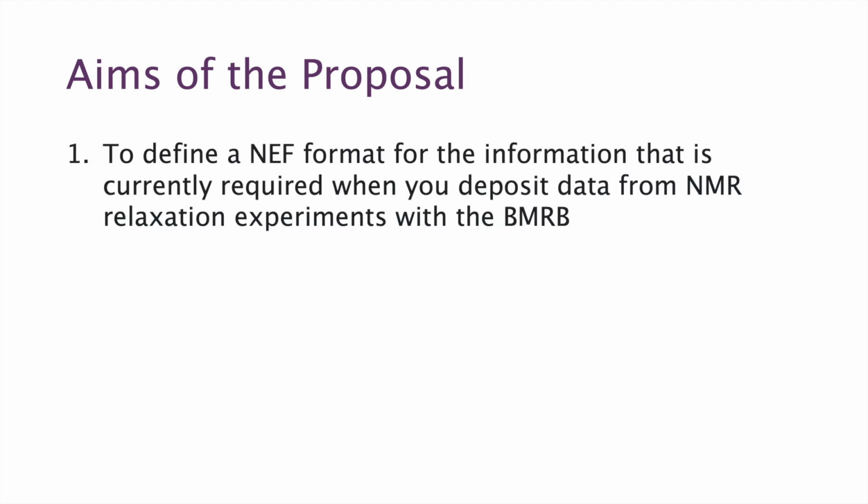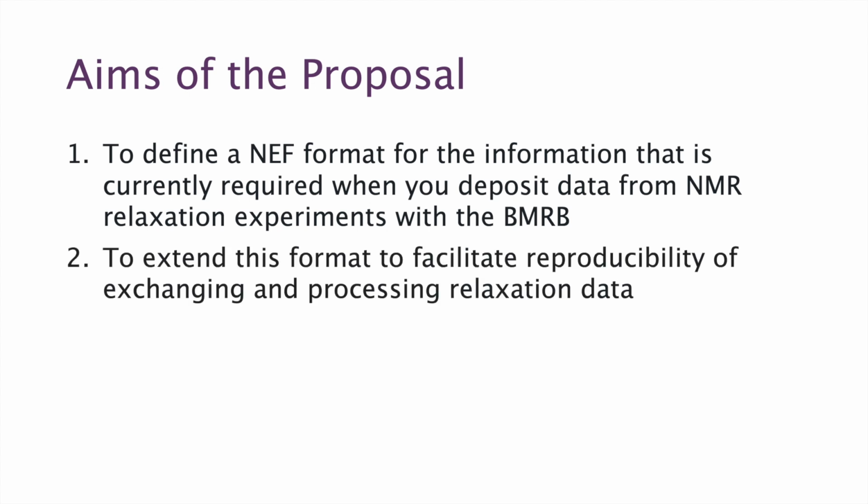There are 2 overarching aims to our proposal for how to include relaxation data in NEF. The first is to define a NEF format for the information that is currently required when you deposit data from NMR relaxation experiments with the BMRB. And secondly, to extend this format to facilitate reproducibility of exchanging and processing relaxation data.